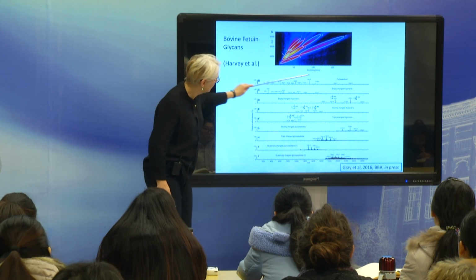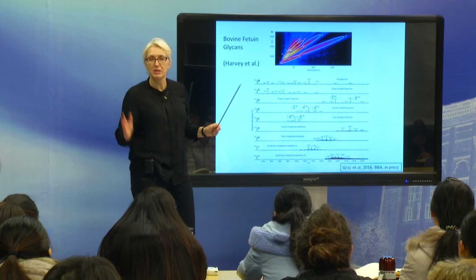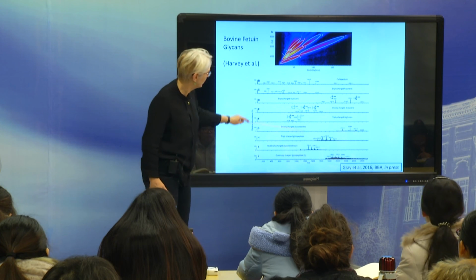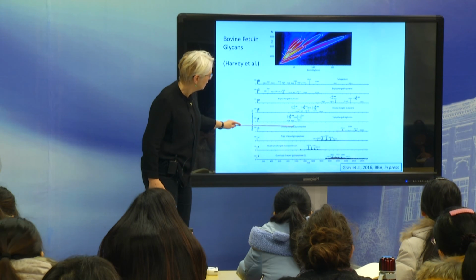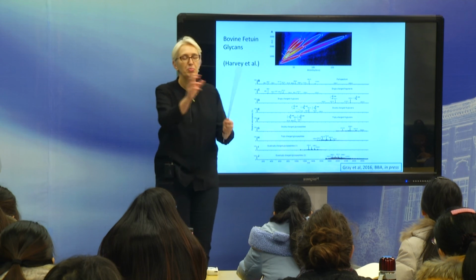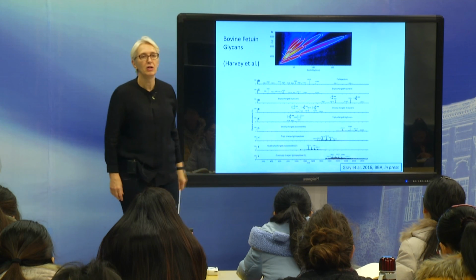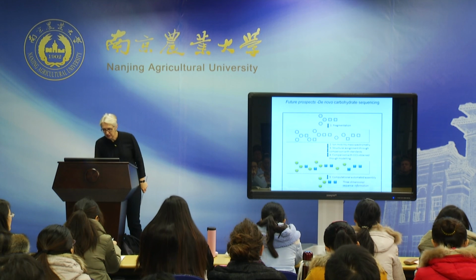So what he's got here is mass spectra of all these different bins from this one sample, and you can see they're all very different. He gets the doubly charged, this is all on N-glycans again, doubly charged, triply charged N-glycans, doubly charged glycopeptides, triply charged glycopeptides. You can pull out all these different species much better than with any other technique, because you've got this capability of 2 dimensions. So it's a very nice way of doing ion mobility.